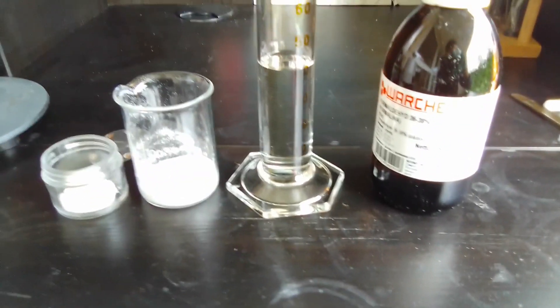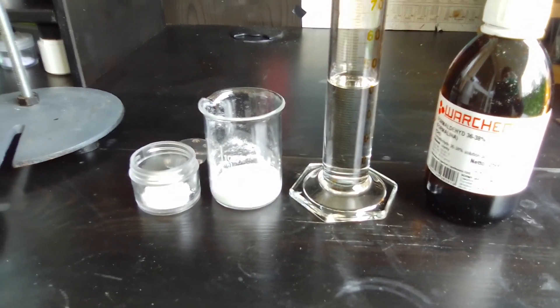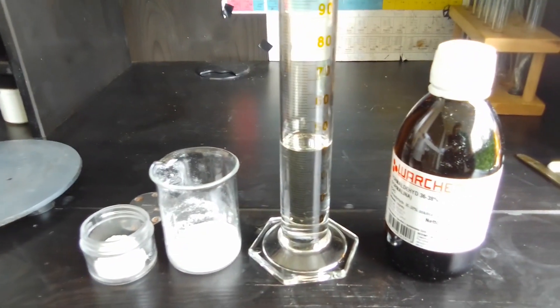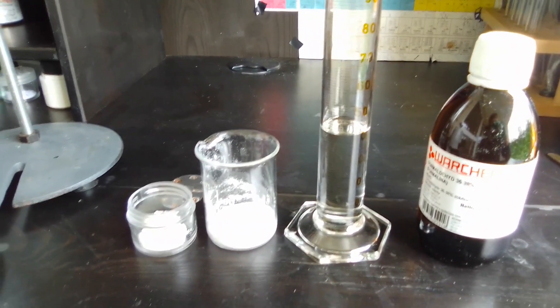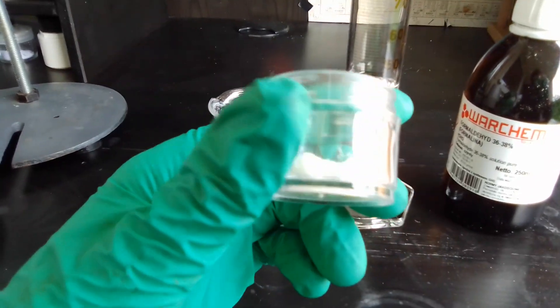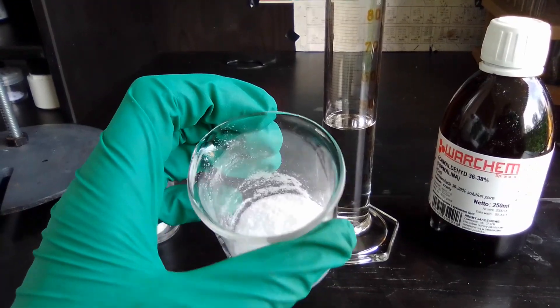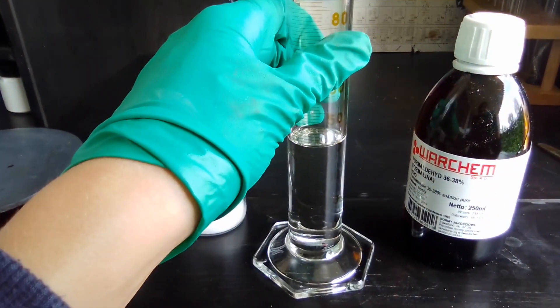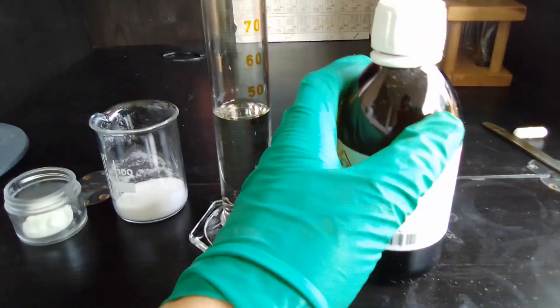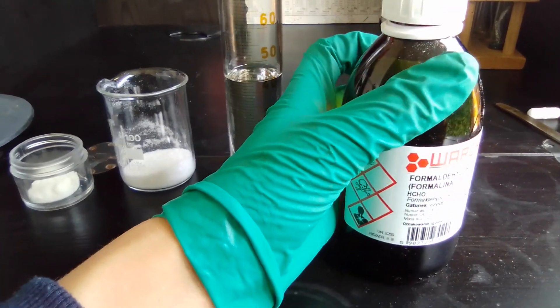In this video I'm going to make aurin tricarboxylic acid. Aurin tricarboxylic acid is actually used to detect small quantities of aluminum in aqueous solutions, which is pretty cool. For this we're going to need 4 grams of sodium nitrite, 12 grams of salicylic acid, 44 milliliters of concentrated sulfuric acid, and about 4 milliliters of concentrated formaldehyde solution.